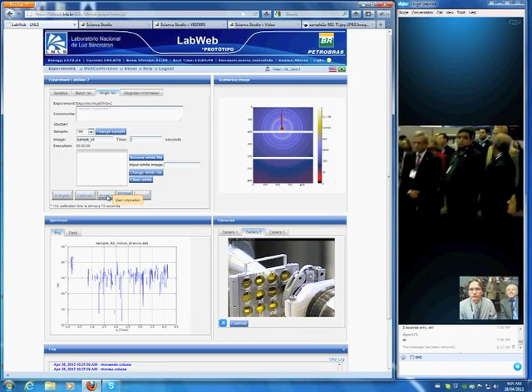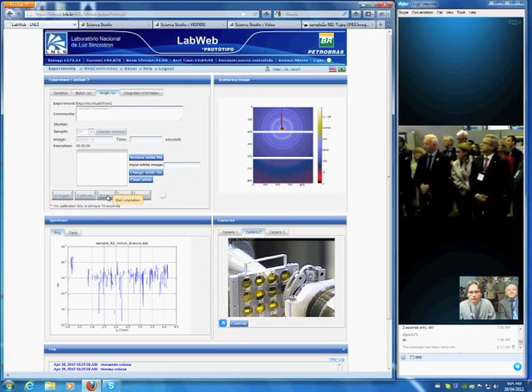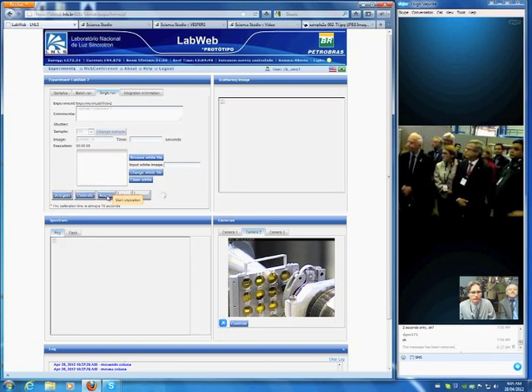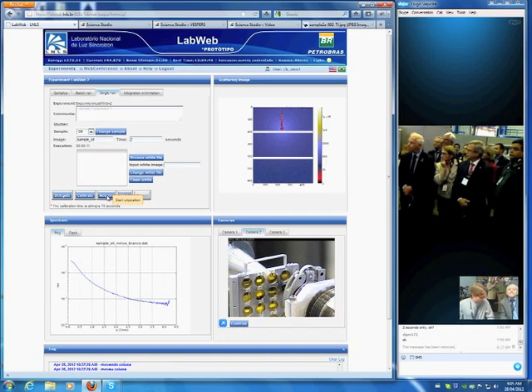And here, okay. So, Harry, just to be clear, this is the measurement right here. Yeah, he measured right here in Canada. Next, we're going to Argentina. You see, this intensity is basically noise. It's not as sharp as the peaks like the other one, but what you can see is that there's a distribution of a molecule called asphaltene, which is a technological problem for the industry, right?